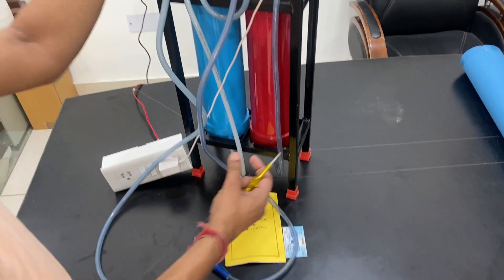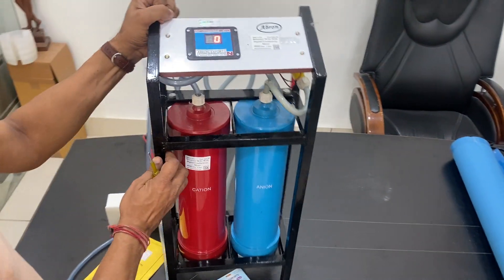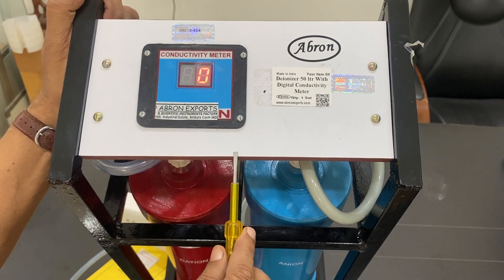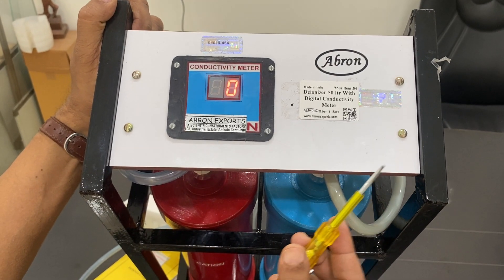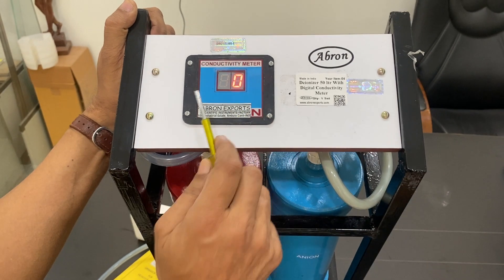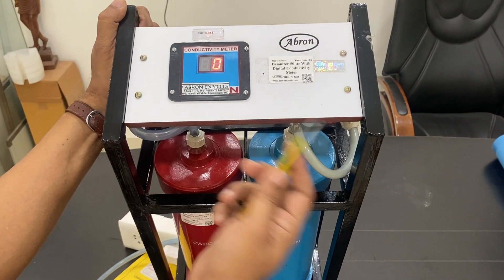The output volume before regeneration depends on the conductivity of your source water. If the water quality in your area is poor, you may get only 300 to 400 liters. If the water is very good, it can yield 500 to 1000 liters. The buzzer sounds when the conductivity value goes above 10 microsiemens — that is the indication to regenerate.